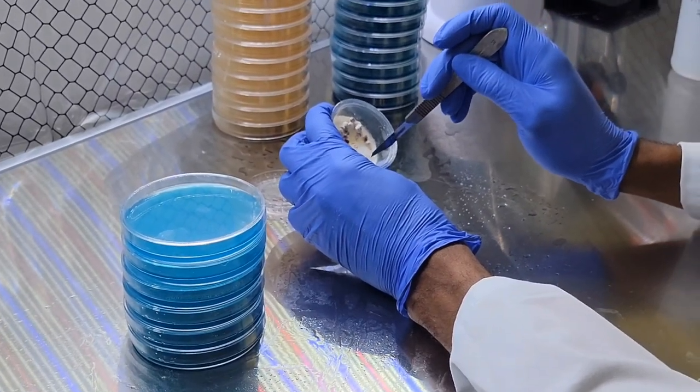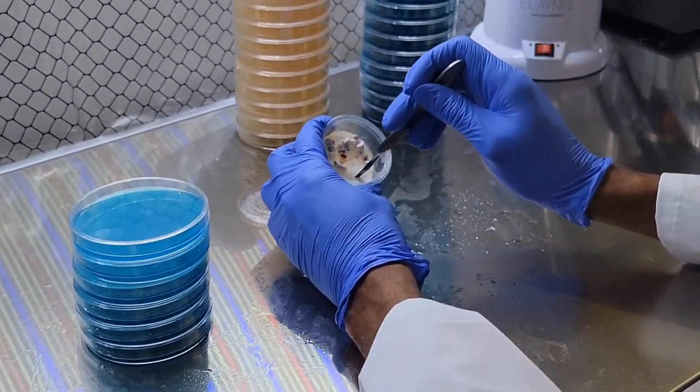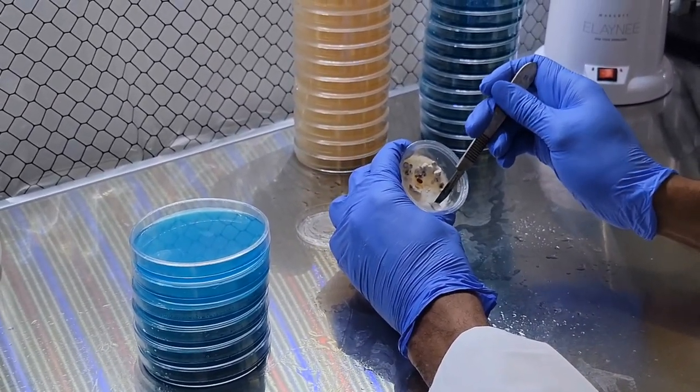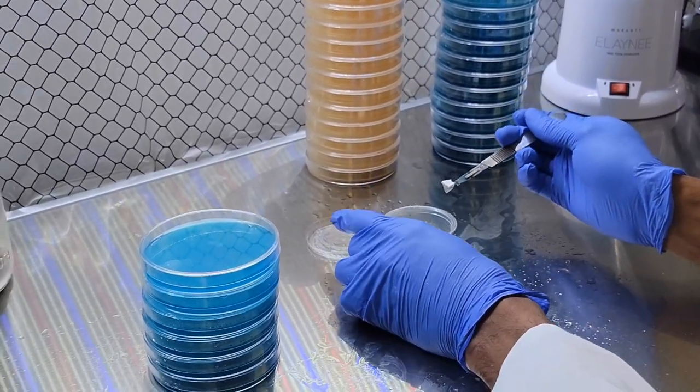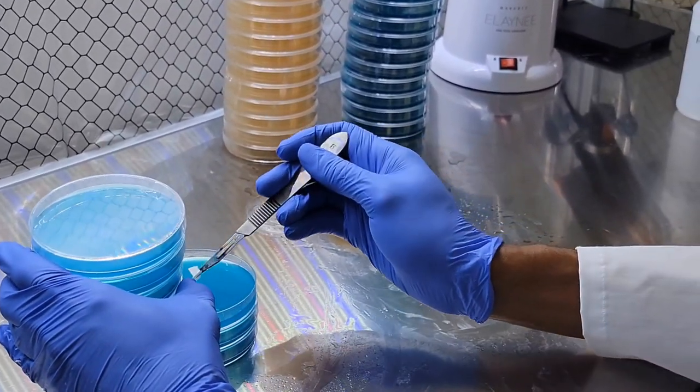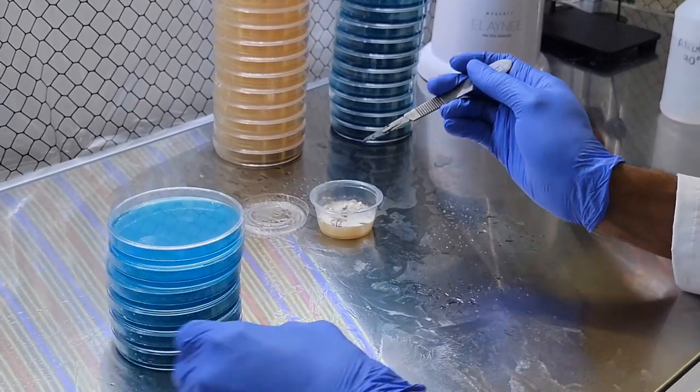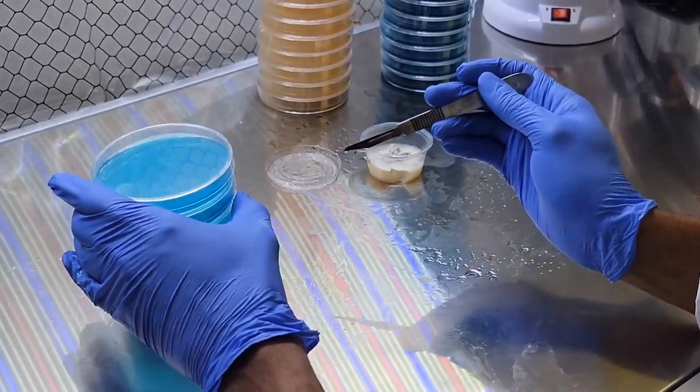And we'll take some mycelium from the furthest edge. This is the freshest mycelium because it's the furthest away from the inoculation point, which is the grain. So you can just kind of gently place it on.